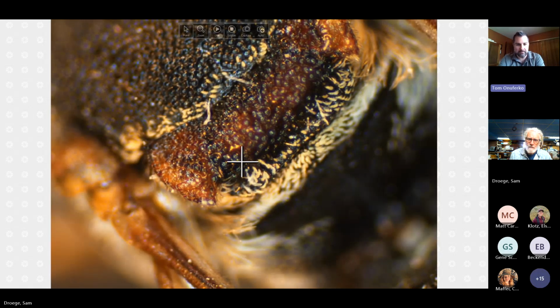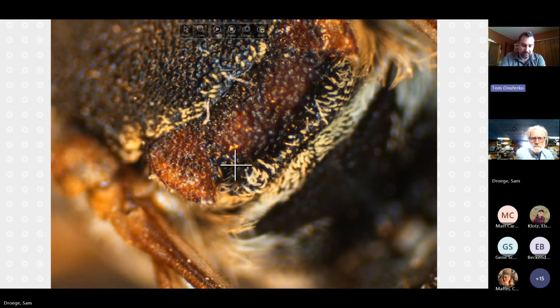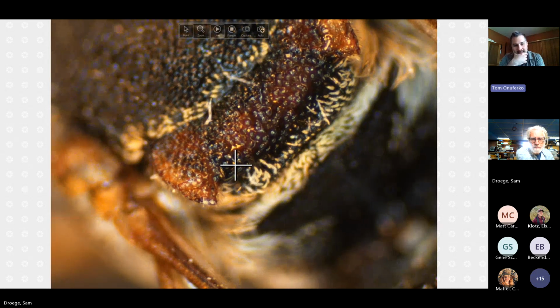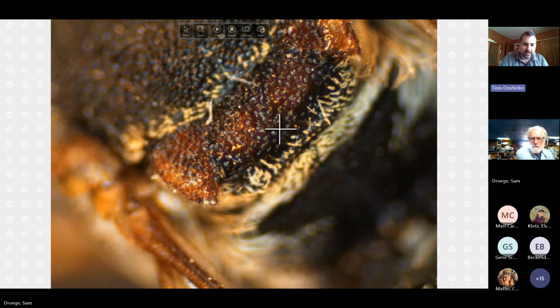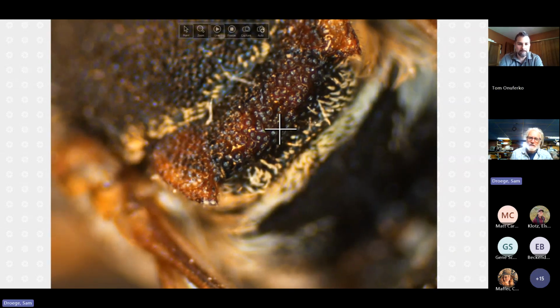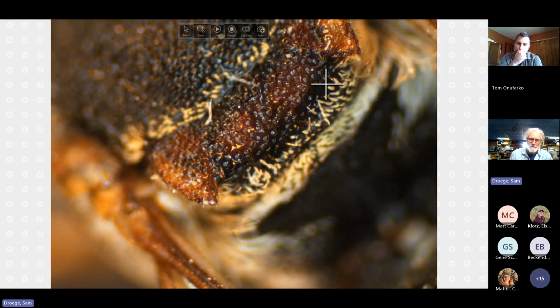The scutellum extends further down, but most of the comparisons I make with reference to the axillae are just to the dorsal portion. There's usually a ridge or carina at the end of it. It's difficult to see because of the lack of shadow here, but there is a pretty strong edge along this line that I'm showing.